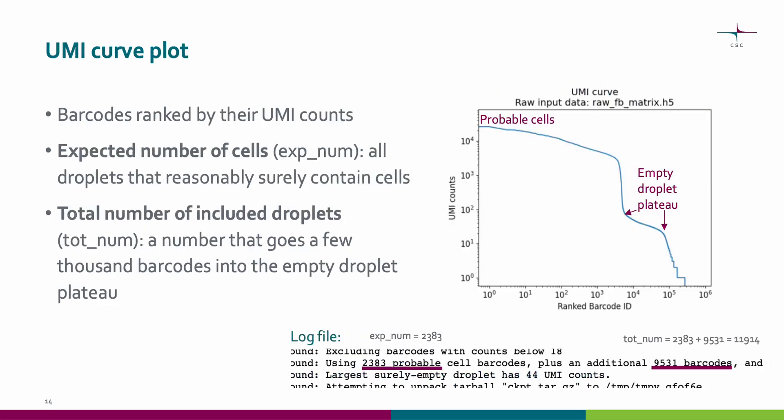The automated report file produces a UMI curve plot. It shows barcodes ranked by their UMI counts. You should use this plot and the log file to see if the automatically estimated values for the expected number of cells and total number of droplets included seem reasonable. The expected number of cells should include all droplets that reasonably surely contain cells. In this example, you can see from the log file that 2,383 are estimated to be surely cells. The total number of included droplets should include a number that goes a few thousand barcodes into the empty droplet plateau and include some droplets that are reasonably surely empty. In this example, this value is the sum of these values in the log file, so almost 12,000, and indeed goes a few thousand barcodes into the empty droplet plateau.